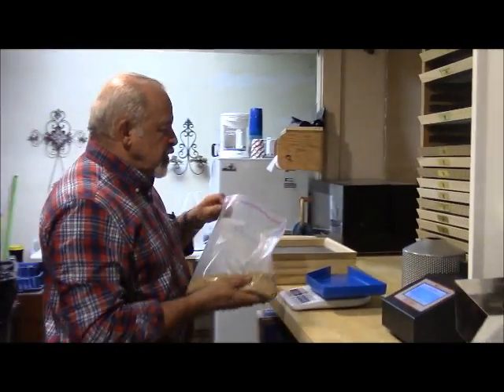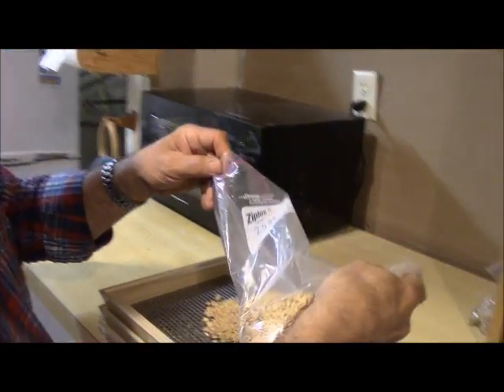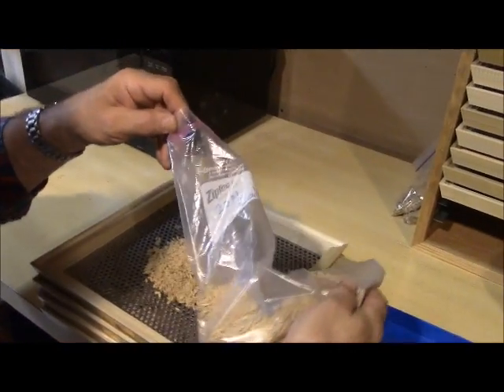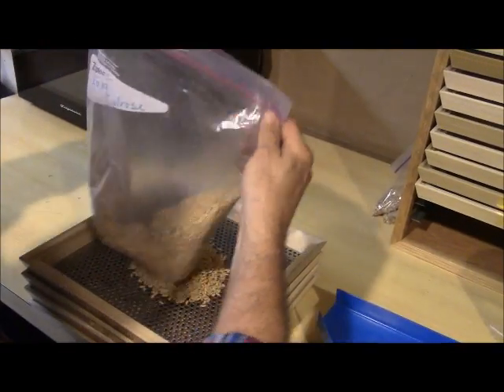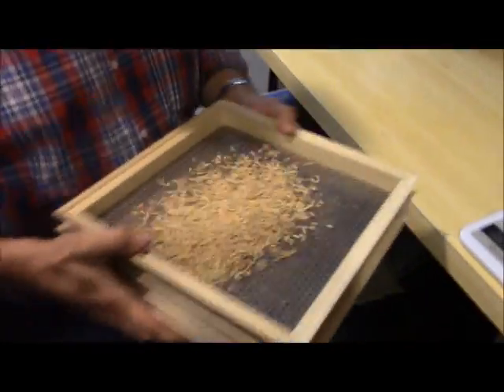First thing we're going to do is screen it to remove the large waste that may be in there, typically straw, as well as fine waste material — that would be broken as well as empty kernels, normally.